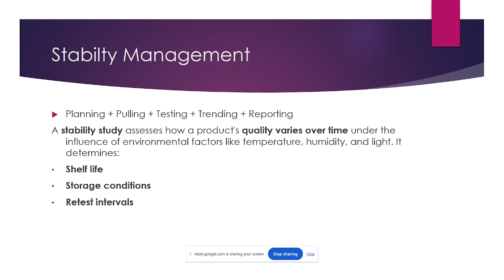After 1 year we need to test once every 6 months. After the second year we need to analyze yearly, up to 36 months or 48 months. For this purpose, stability management: every time we cannot go to the stability chambers and check manually whether 3 months, 6 months, or 9 months is done and testing is required or not. So this stability management module is helpful for auto creation.